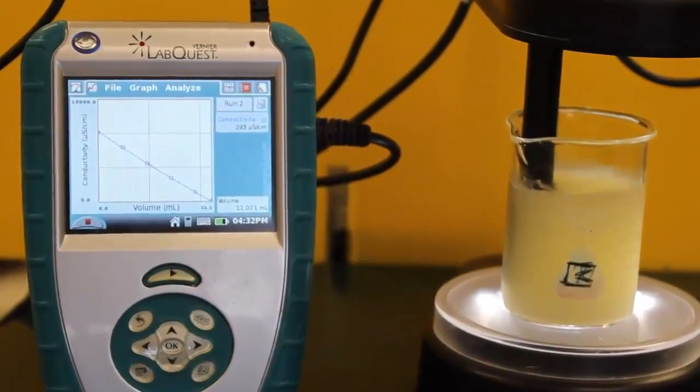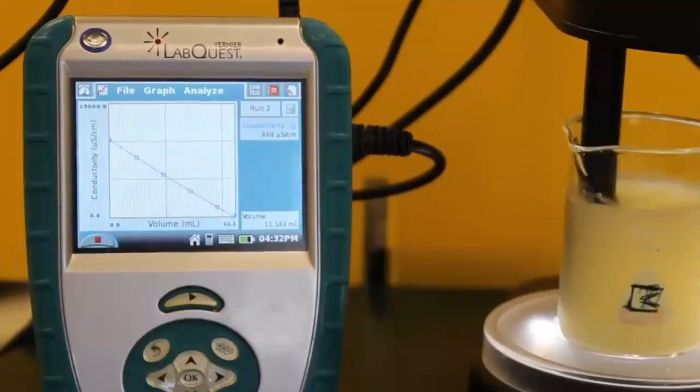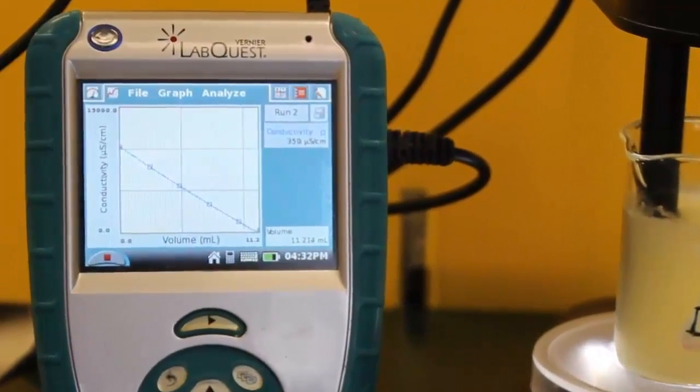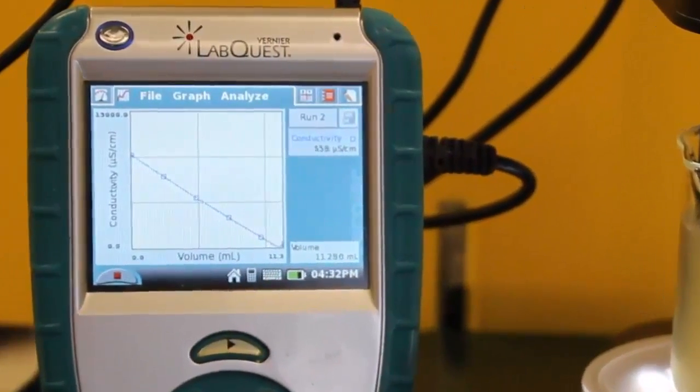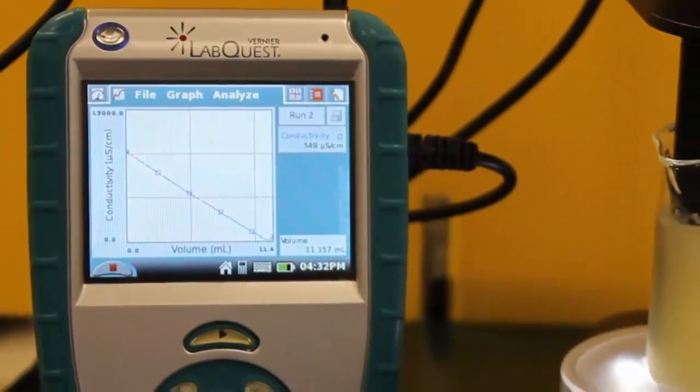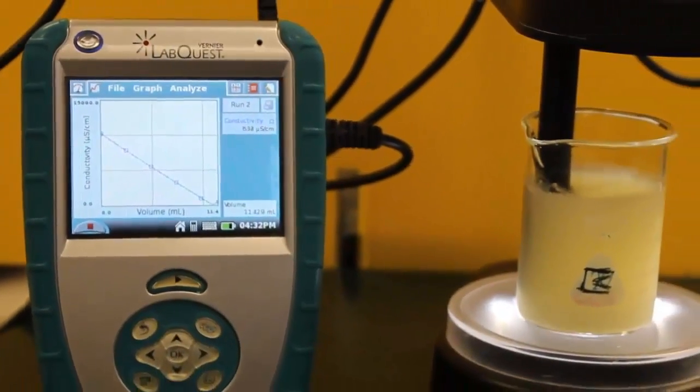Also notice on the Lab Quest you can see that the conductivity of the solution has started to increase, indicating we have passed the equivalence point. We'll keep adding the sulfuric acid solution drop by drop, always carefully measuring the volume.